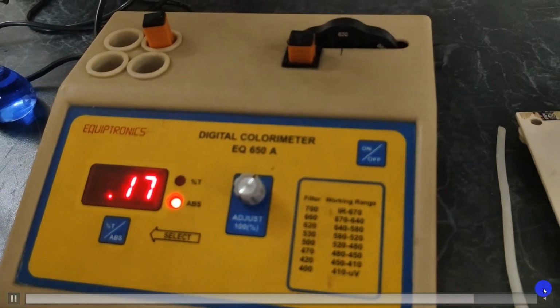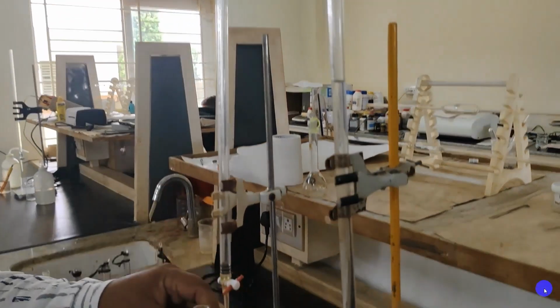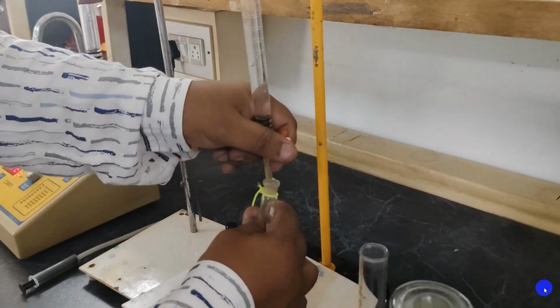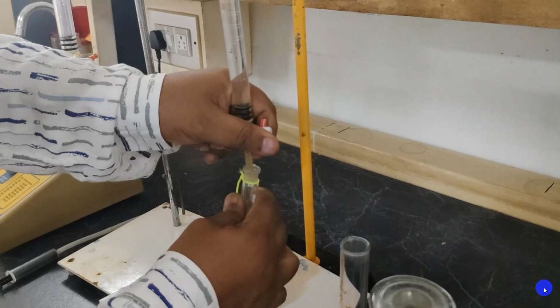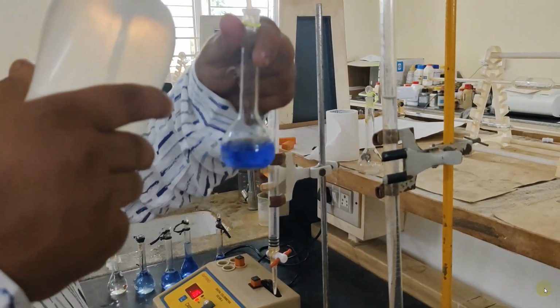And now, this is the test solution whose copper concentration is unknown to us. To this again add 5 cm cube of ammonia solution and make it up to the mark, and note down the colorimetric reading, which is the absorbance provided by this solution.